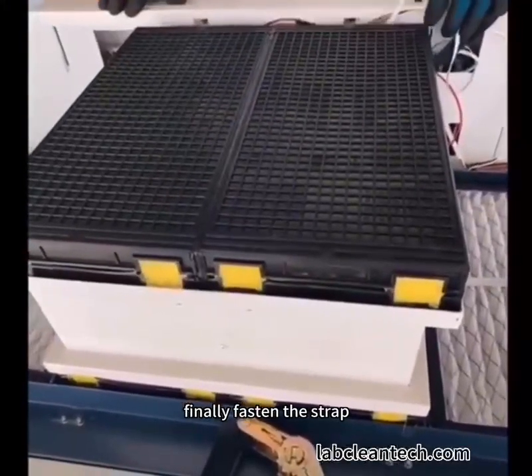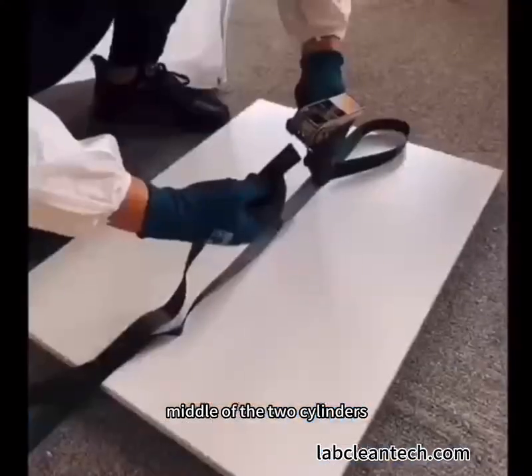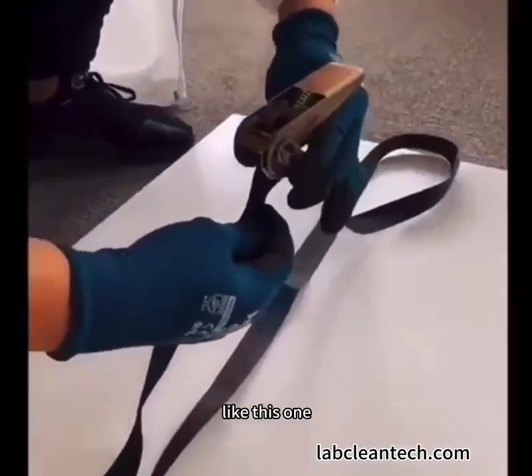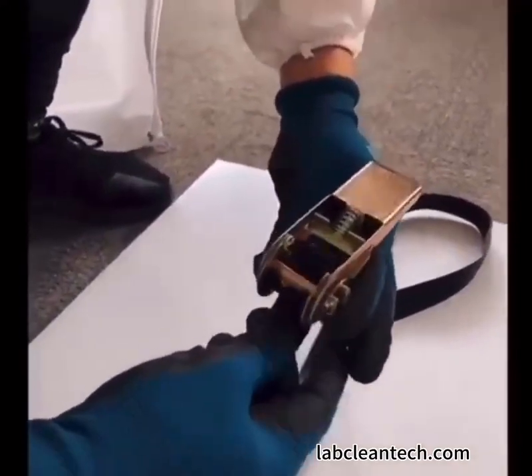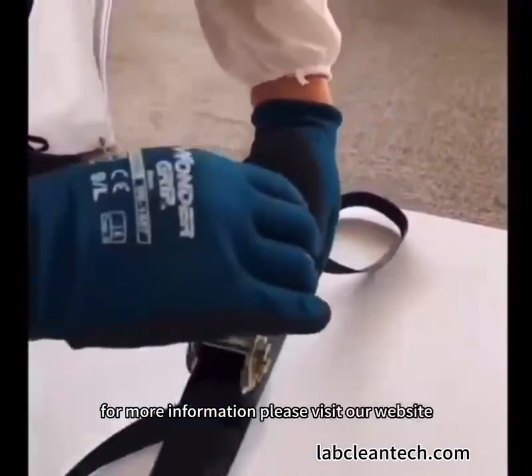Finally, fasten the strap. The strap should go through the gap in the middle of the two cylinders, like this one. Then press the buckles repeatedly until fasten tight.